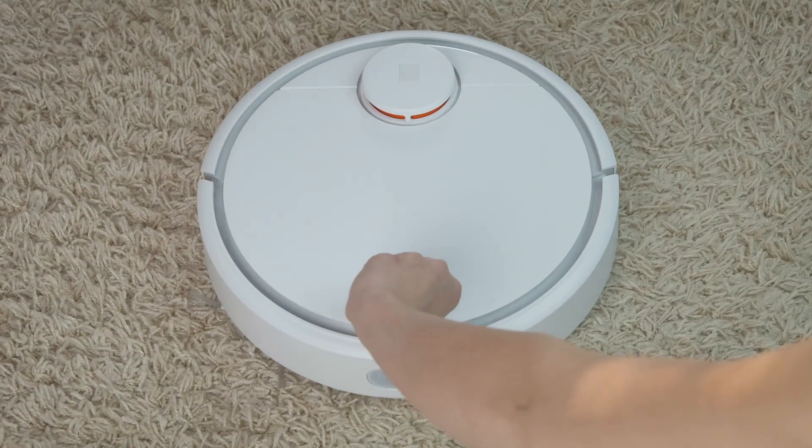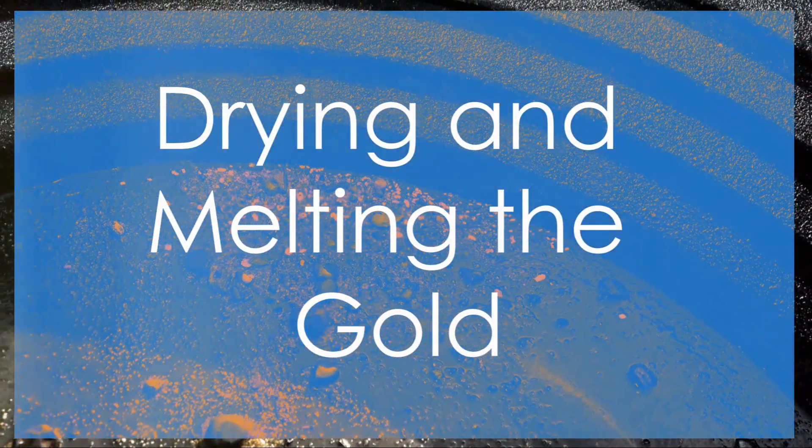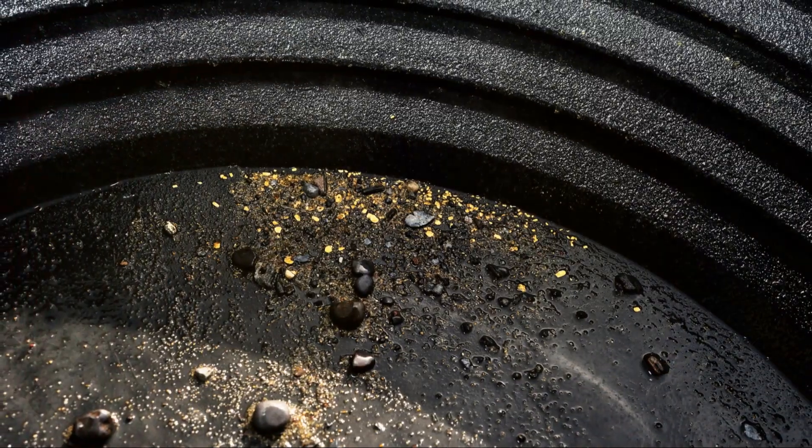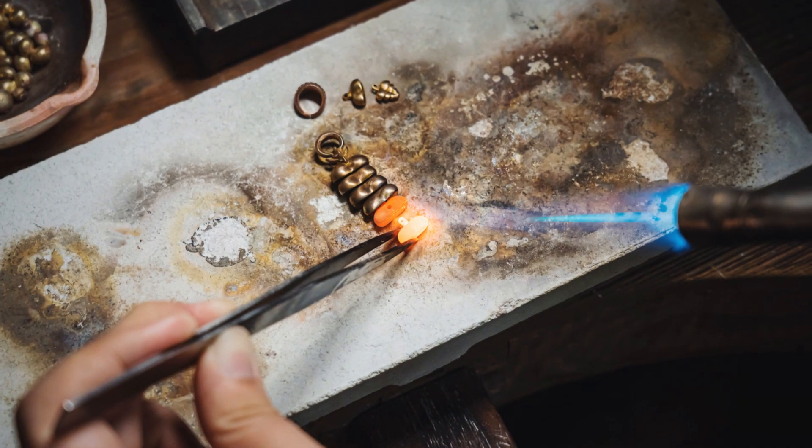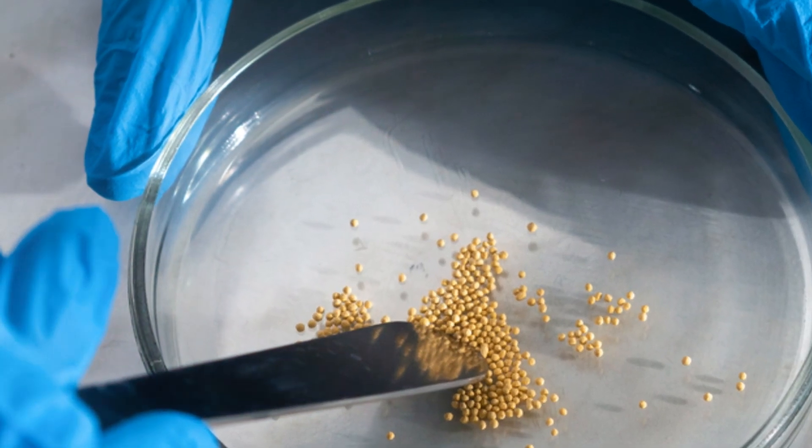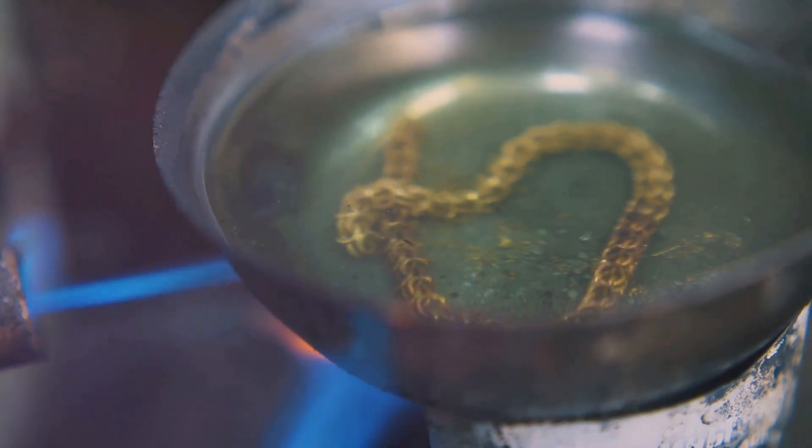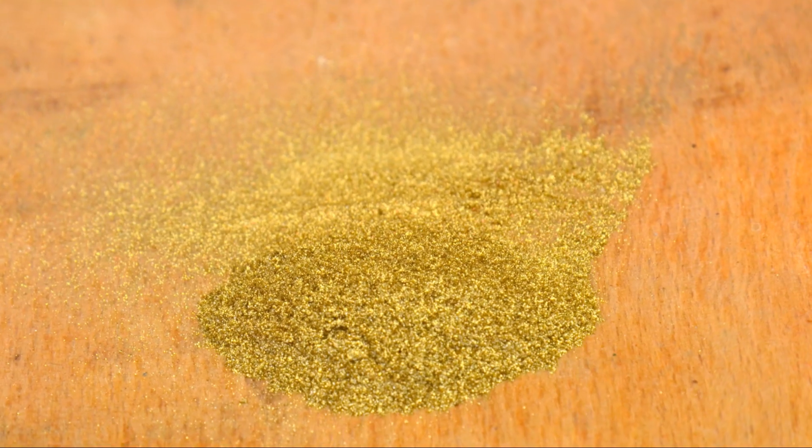We're almost there. From powder to treasure: drying and melting the gold. The moment we've all been waiting for is finally here. We're about to turn that brownish powder on our filter paper into shiny solid gold. First, we need to dry our gold powder completely. You can do this by leaving it out in a warm dry place for a few hours, or by gently heating it on a hot plate.